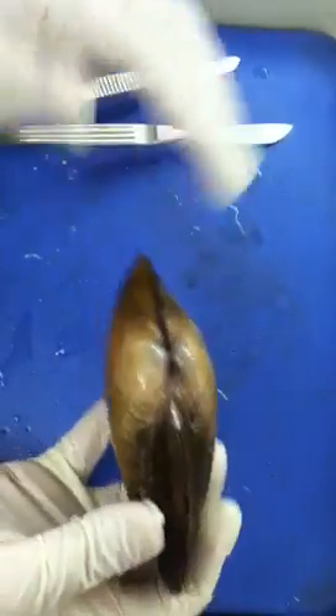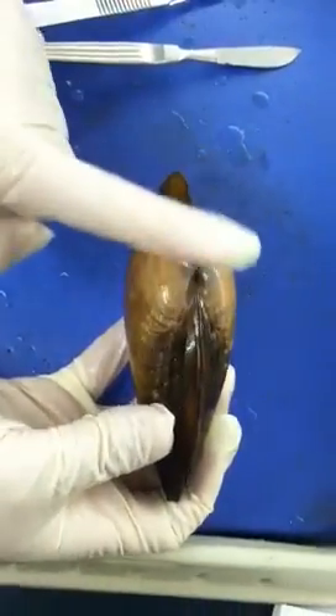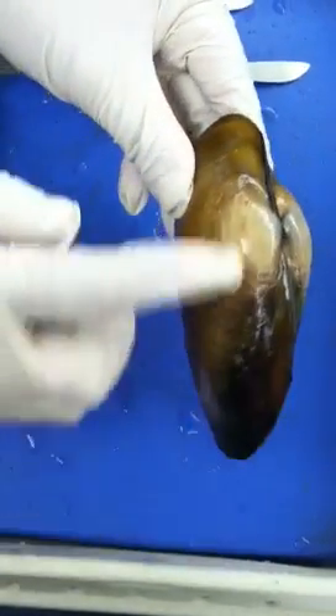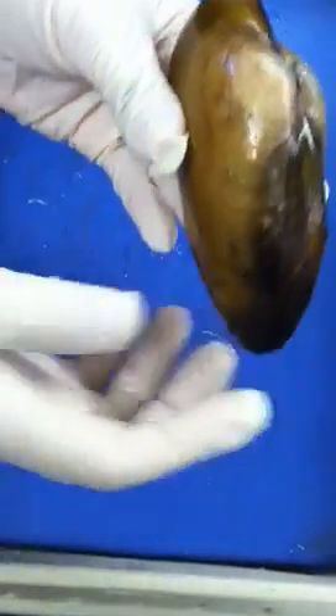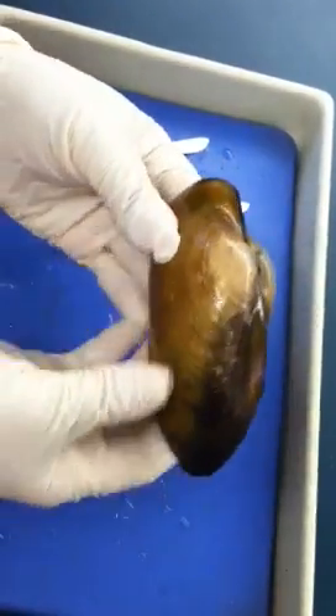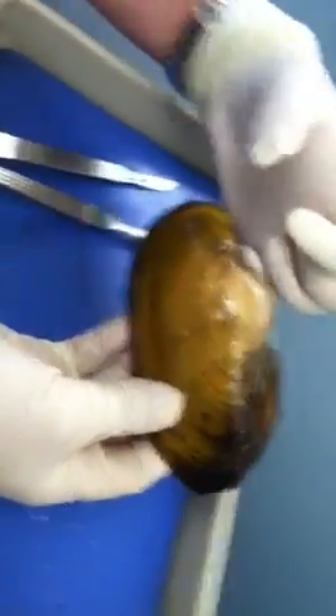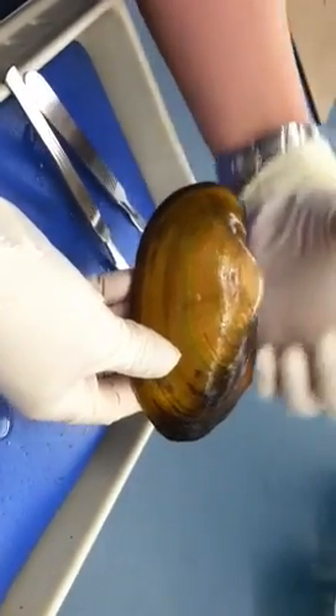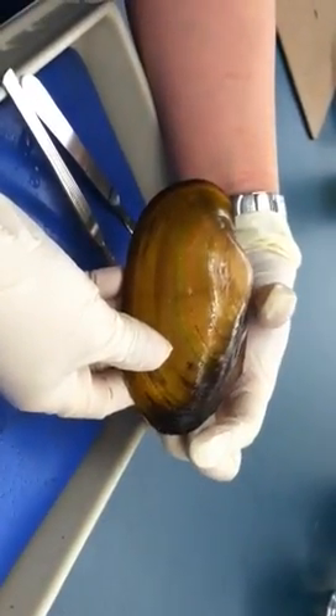the first thing you need to know for this class will be the umbo — those will be the two bumps over here. After you see the umbo, you need to identify where the anterior side is and where the posterior side is. The shorter side will be anterior, and the longer side is what we call posterior.